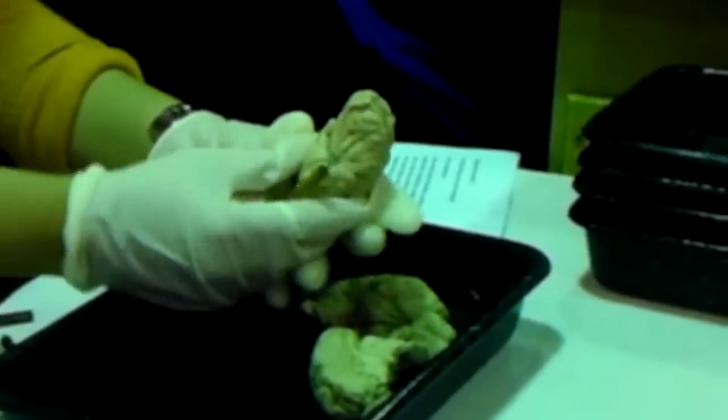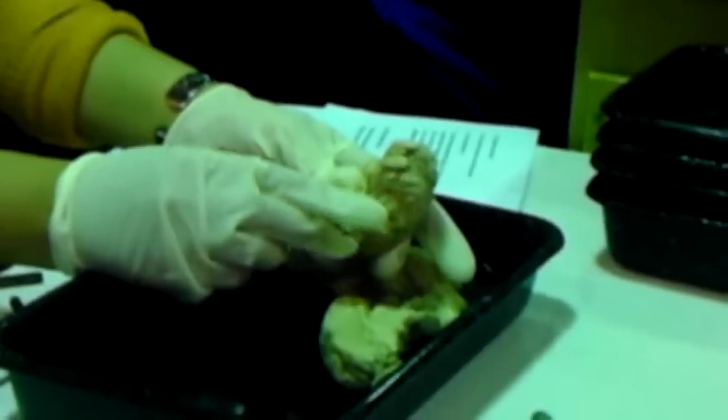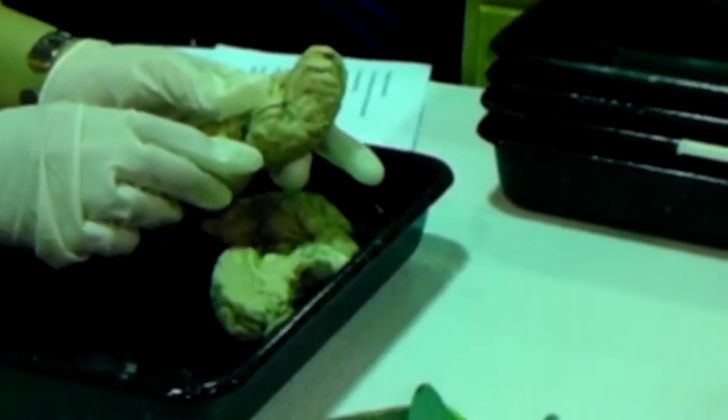Then, look at the olfactory bulb here. So this is your olfactory nerve, huh? Can you see the bulge area here? This is called olfactory bulb. And this is olfactory. Are you okay? And these are the olfactory nerves.